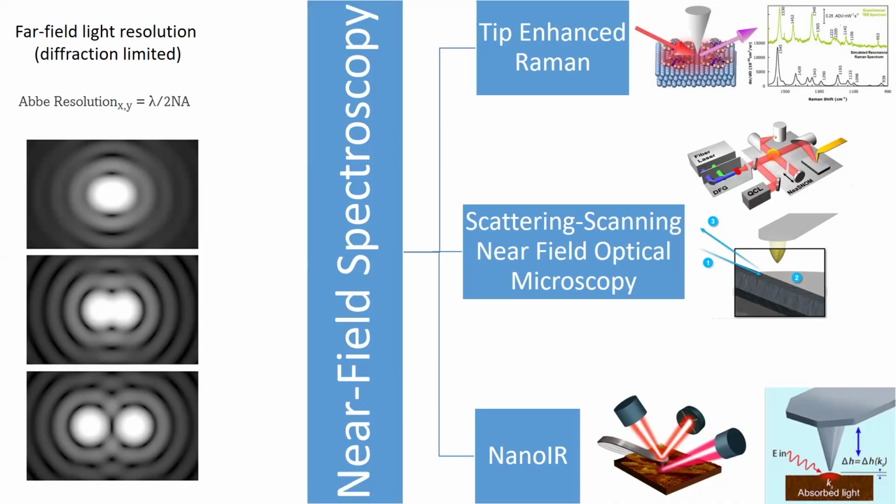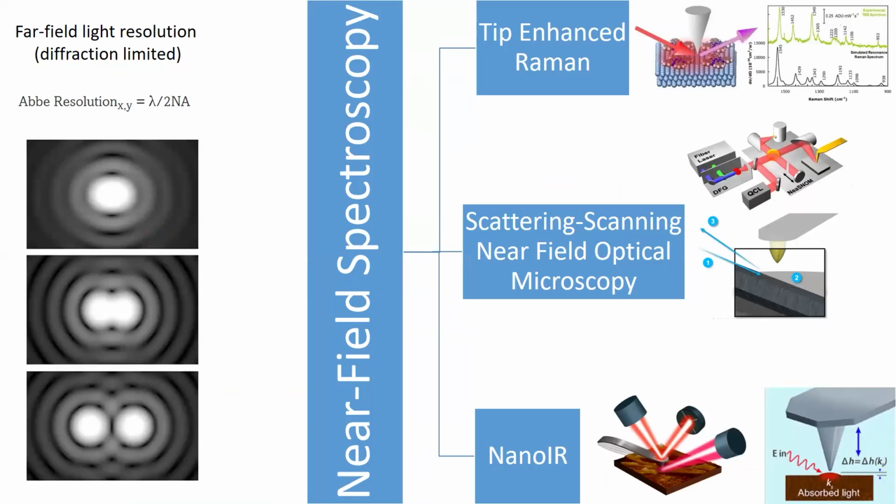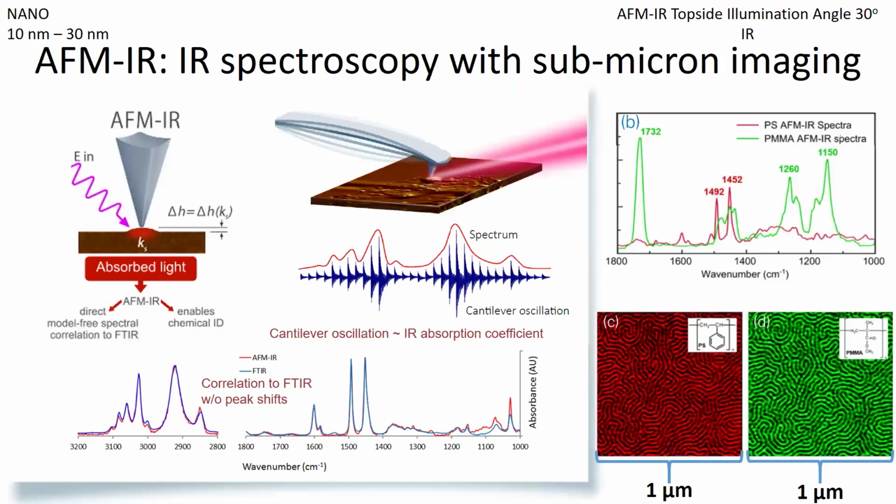And so this is what's really novel about this particular technique, because it's extremely difficult to differentiate the light that's scattered from a femtoliter of volume of your sample compared to the giant spot that you're irradiating your sample with, the far field light. And you have to use tricks to basically overcome that. In this case, you're using the incredible sensitivity of this probe to act as your detector. And so that's what's happened.